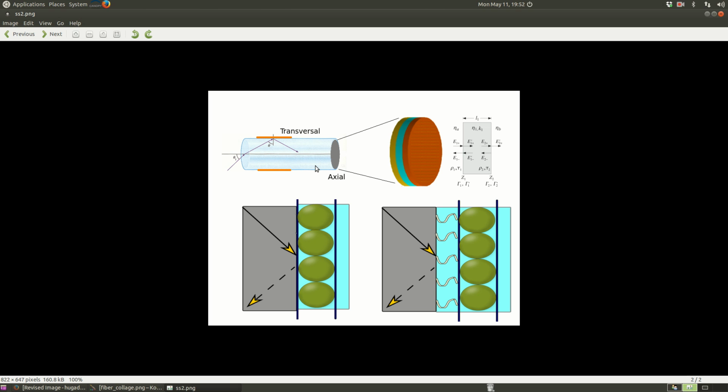When using optical fibers with materials, i.e. films and stacks of films, we have two options of how to place them on the fiber. The first is to cleave the fiber, exposing its core, and then to deposit the materials flush to the cleaved end face. This configuration I like to refer to as axial, and it's also referred to as the dip and read configuration because devices built on it are generally dipped into samples like probes.